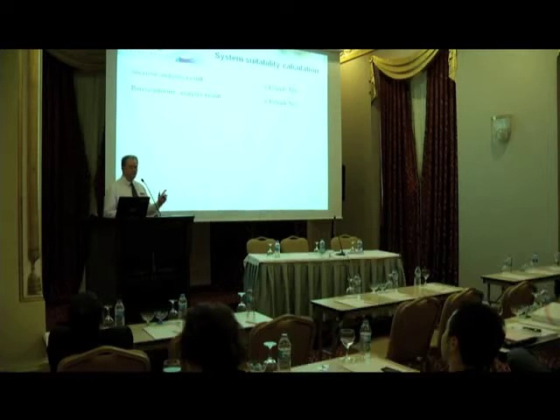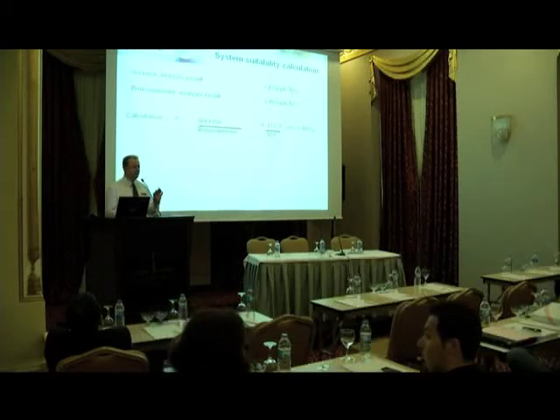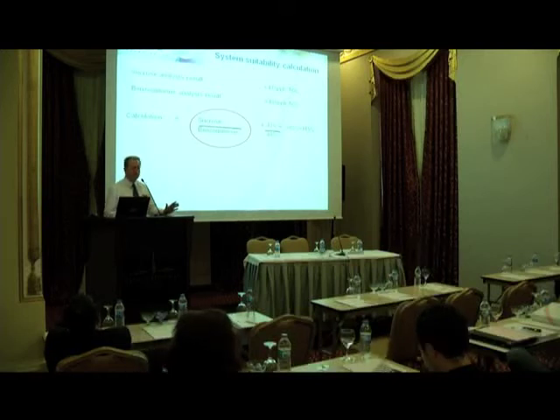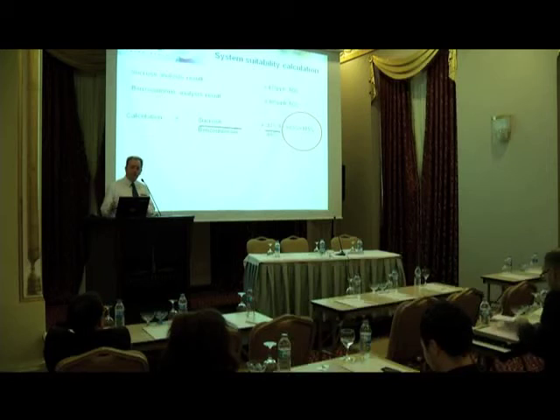You put through the benzoquinone, you get a slightly different number. What is important is that those two numbers are very close together. We're looking at the effectiveness of this analyzer to oxidize these organic materials. We're not trying to calibrate it. So we look at the ratio of these two, and we want to make sure it's within an acceptable tolerance. So this analyzer will analyze all the organic material, doesn't matter what it is, effectively. So system suitability is a check on the analyzer's ability to oxidize.